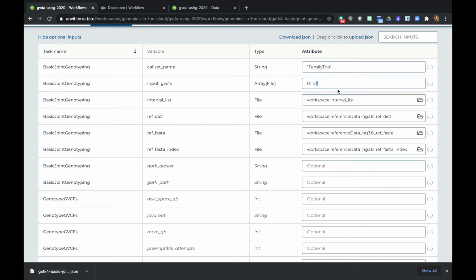So we need to do this dot sequencing, except we're actually going to add an S, which will tell the system to look up items in the sequencing table. And finally, we'll add the column name, for which I'll use an X as a placeholder for now. And so the last piece of this is to look up the appropriate column name in the sequencing table that we're going to put instead of the X. So let's go do that now.